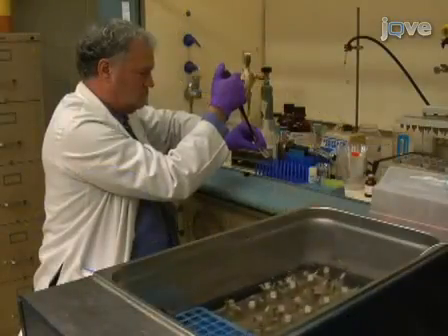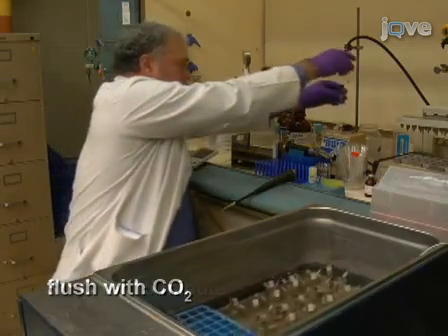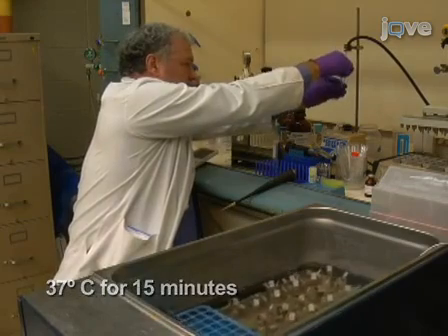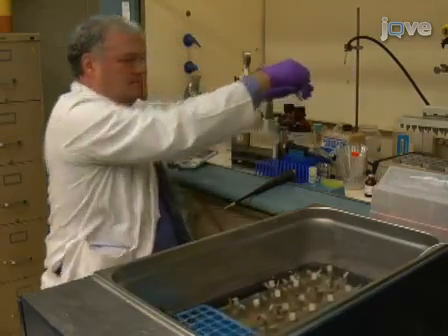At the end of the 30-minute incubation, add 20 microliters more of the urease solution, flush the vial with carbon dioxide, and maintain the sample at 37 degrees Celsius for another 15 minutes. Once the urease treatment is complete, proceed directly to dehydrate and derivatize the sample.